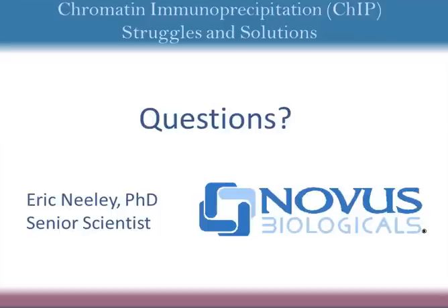So if you see that the antibody is well validated in other terms, if it's working in IHC or ICC, so that you know that it's working in its native conformation, if you see that it has dot blots or any sort of peptide arrays associated with it from publications, especially for these modified antibodies, so that you know that it's absolutely specific, because that is a huge problem where a lot of these modified antibodies, especially the histone ones, will be picking up more than they say they are.